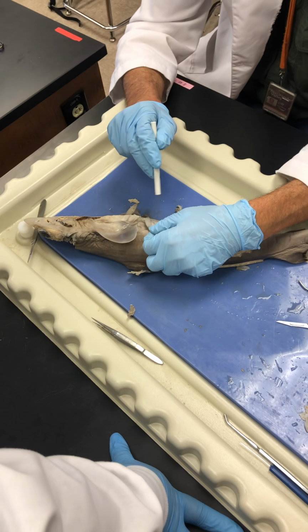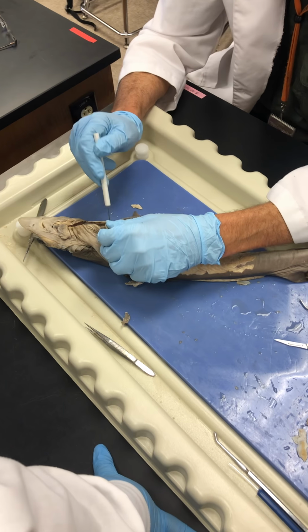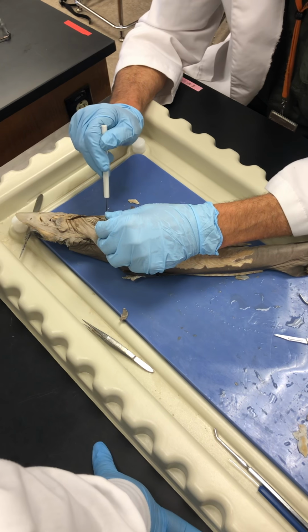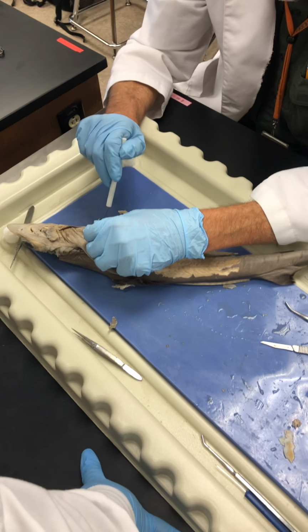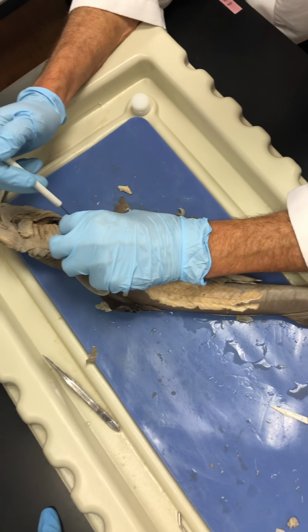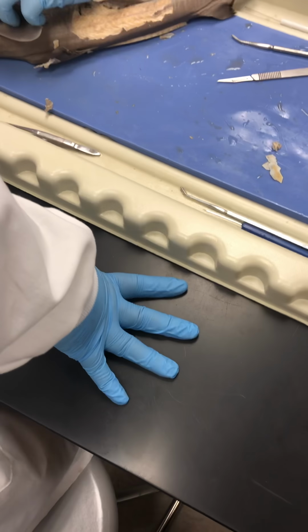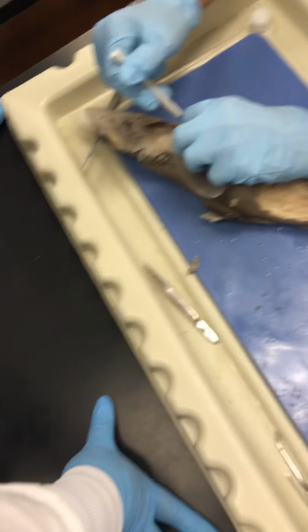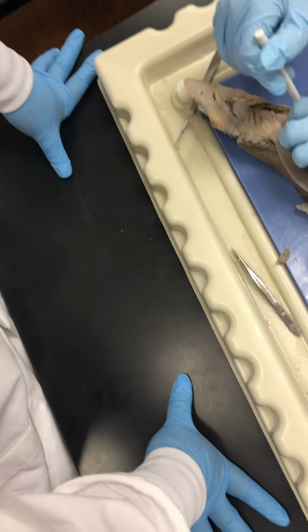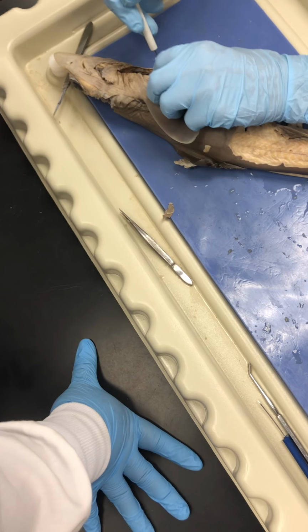Okay. Now, also on the liver, and you really can't see it very well, I think these were farm-raised sharks because the wild ones have very large gallbladders. The ones that are fed processed foods, like what we feed your fish tanks, don't need much bile. It's not a lot of protein. And so they're saving money that way. And so it doesn't have much of a gallbladder. If you eat a lot of protein, you're going to have a big gallbladder because the gallbladder is going to produce bile.